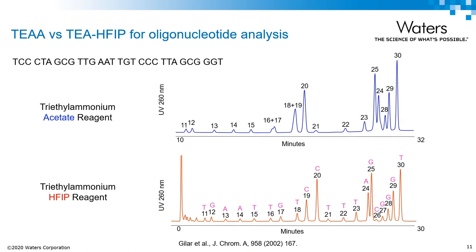Here we have a 30 mer species run using TEA buffered in both acetate and HFIP. An obvious difference between these two chromatograms is the inability of TEAA to separate all of the failed sequences compared to TEA-HFIP. TEAA, which is a less efficient ion pairing agent, shows changes in selectivity and even has some co-elutions.